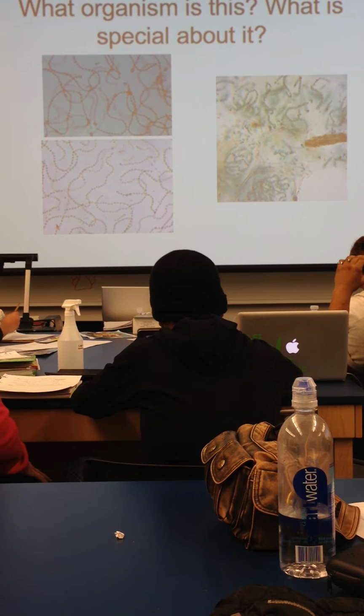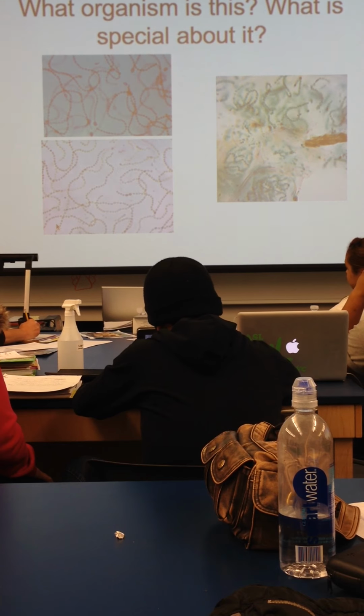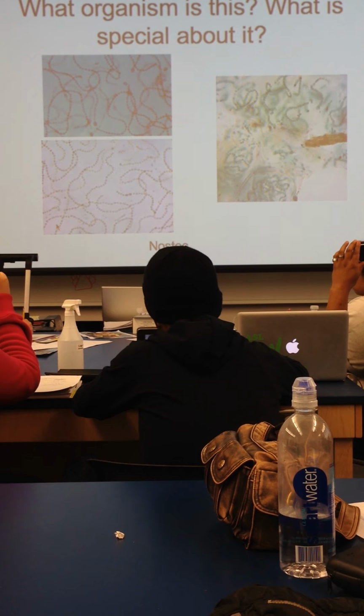Alright. So, what organism is this? What is special about it? Now, I don't expect you to remember the exact organism name, but can you tell me what kind of organism it is? Oh, that's the special term, yes. So what did we see that was colonial? Oh, it's not oscillatoria, but you're so super close. What was oscillatoria? Yes, it's colonial. Thank you, Ryan. It's bacteria. This guy was nostoc, okay?